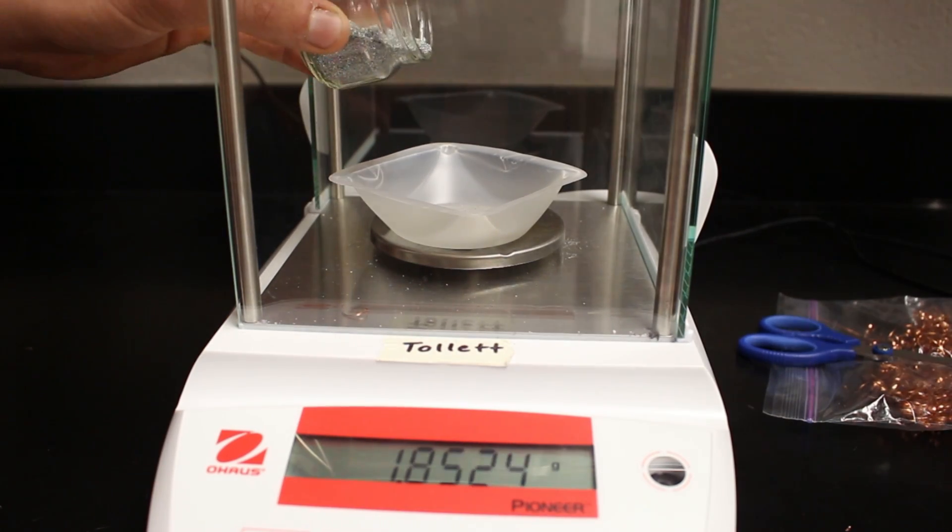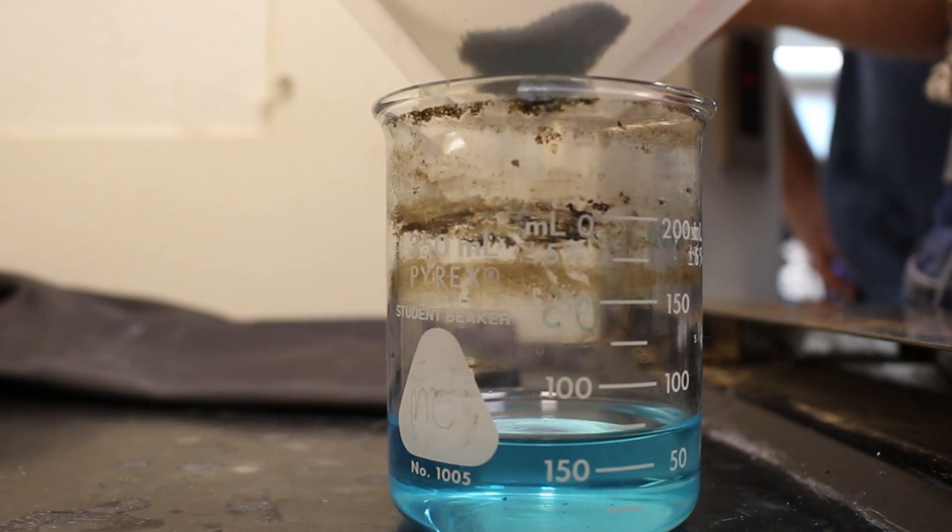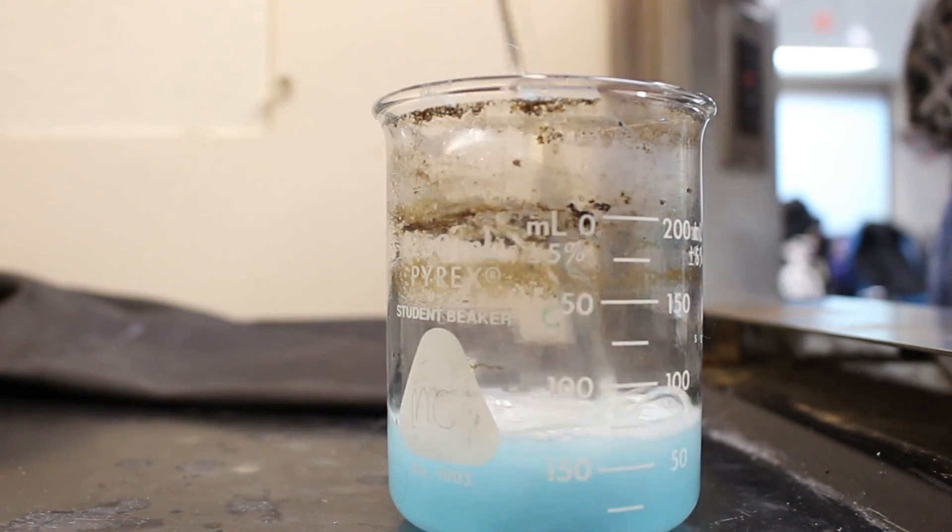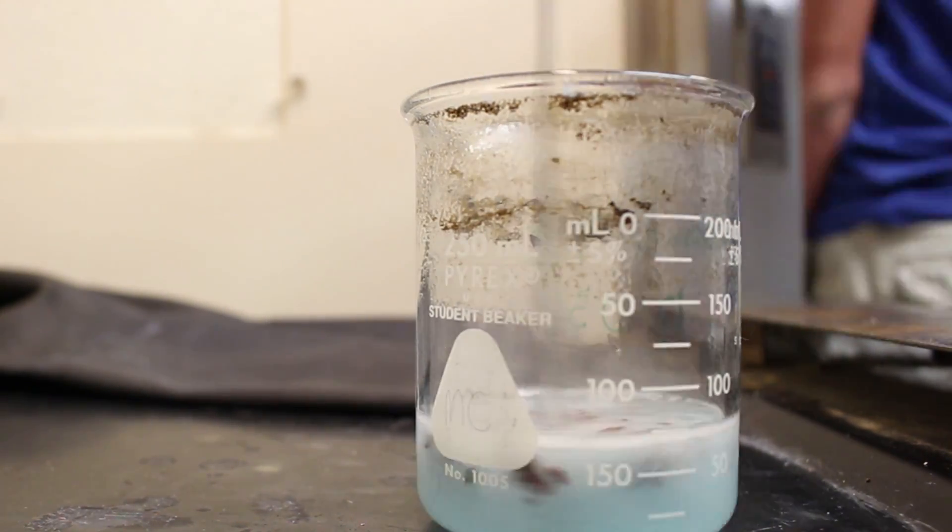We massed approximately 2 grams of 30 mesh zinc on the balance and added it to our solution of cupric ions. The zinc slowly reduced the cupric ions to solid copper and reacted with the sulfuric acid to produce hydrogen gas.